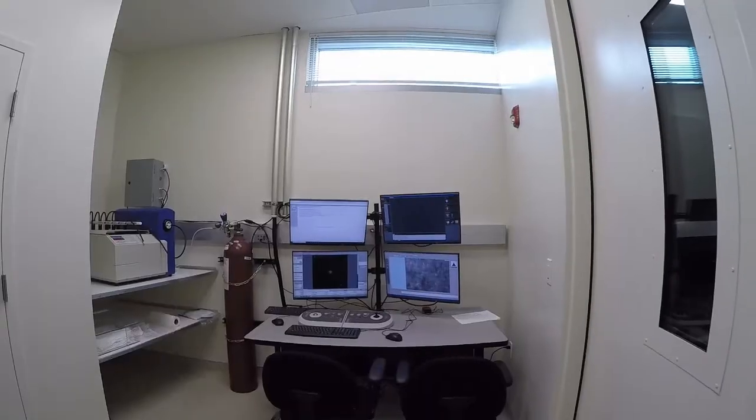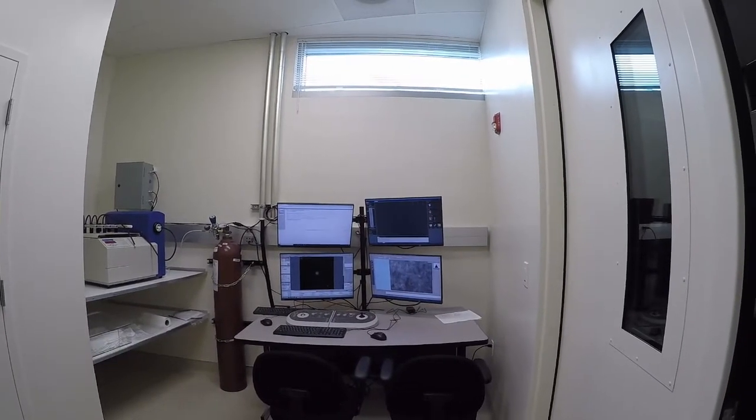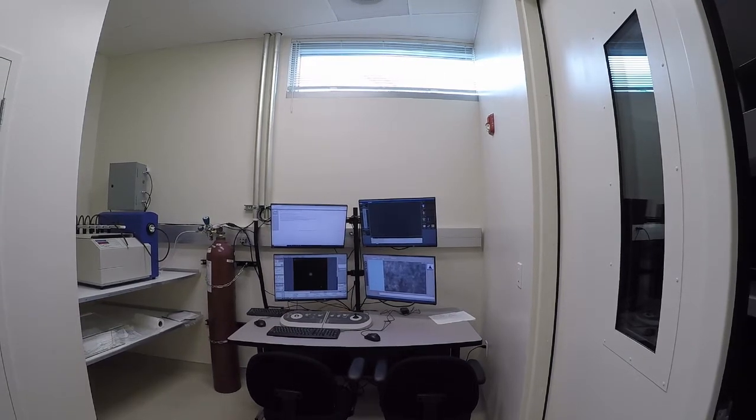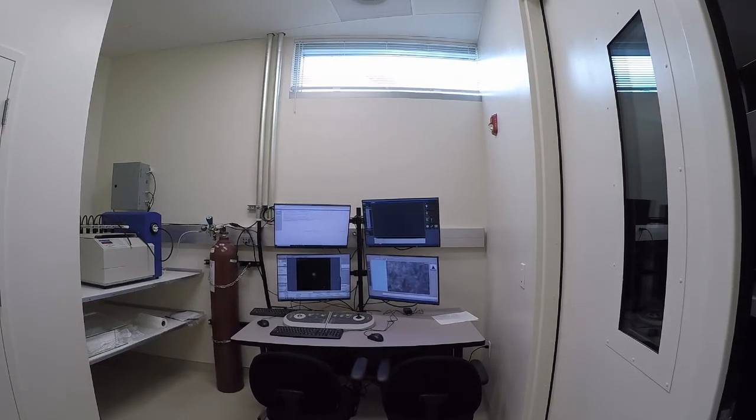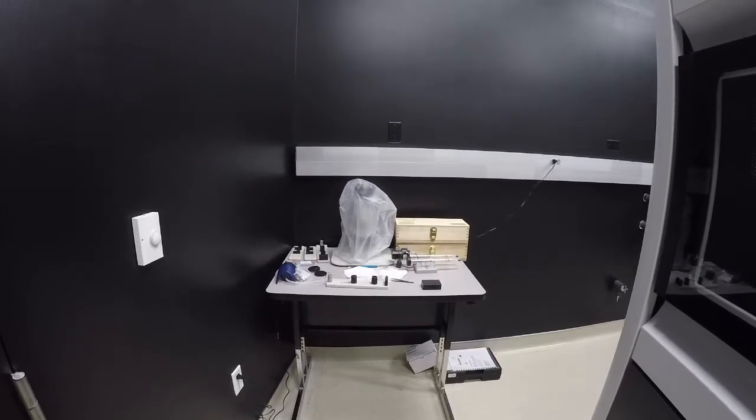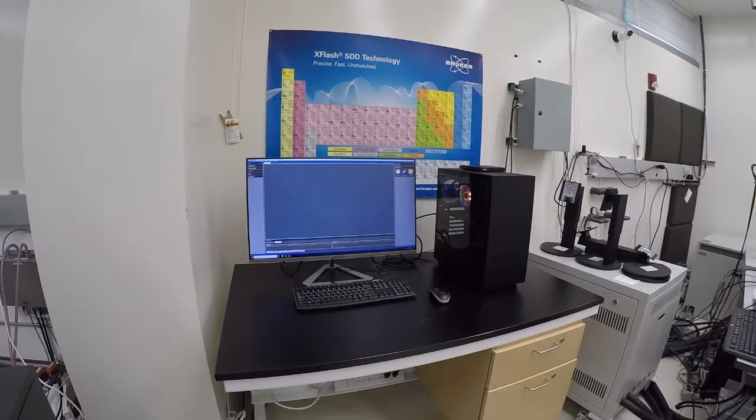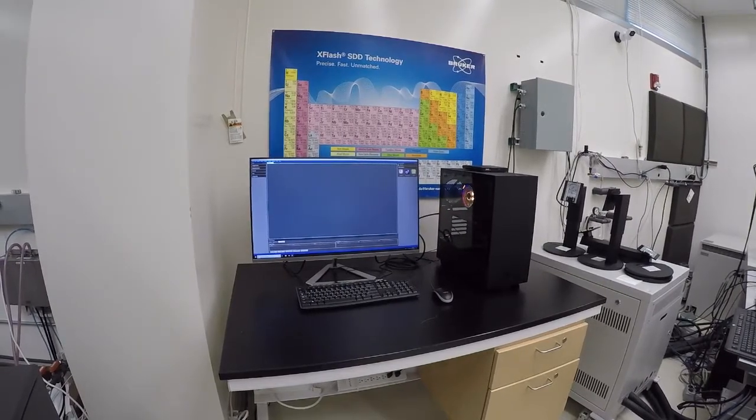The operator space contains the workstation used to control the microscope and a plasma cleaner. Inside the microscope room there is a sample preparation desk. Finally, there is an analysis computer with advanced TEM software in the microscopy lab.